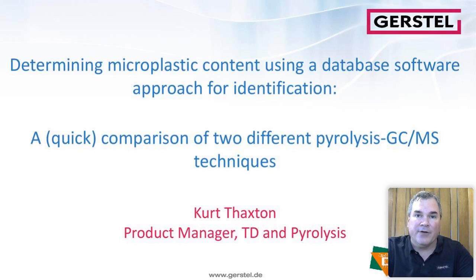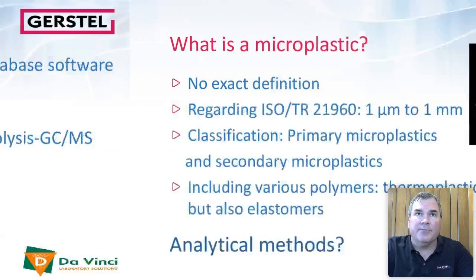So I'm very grateful. We're going to talk about microplastics analysis using what is essentially two different ways to do pyrolysis. One, which is more traditional, but I'm going to spend most of my time talking about a new technique that was developed by the German Institute for Material Research and Testing in Gerstel. So without any further delay, let's jump right on in.